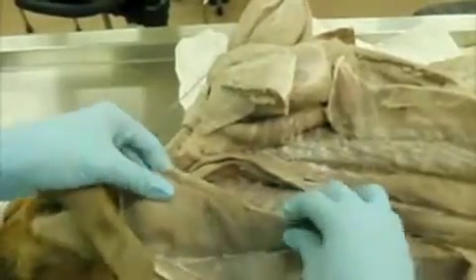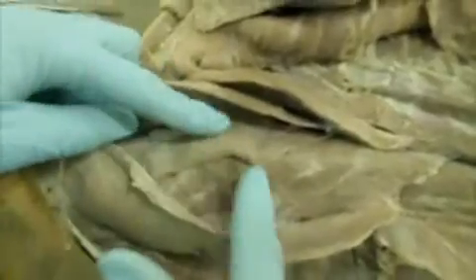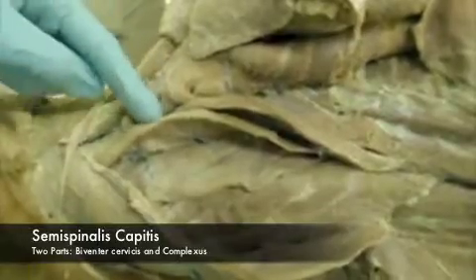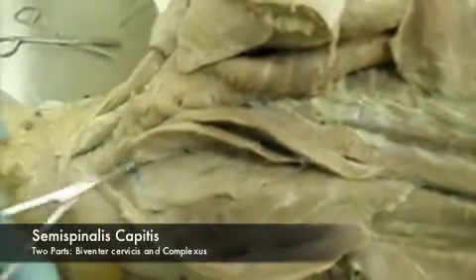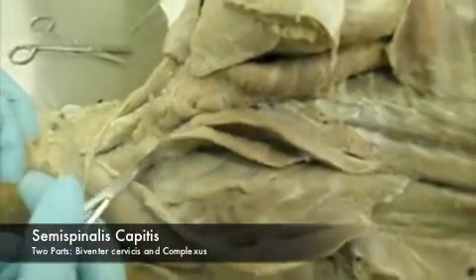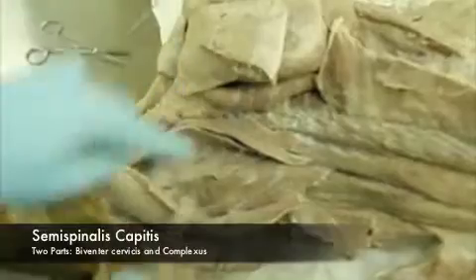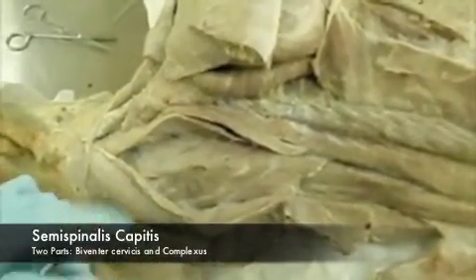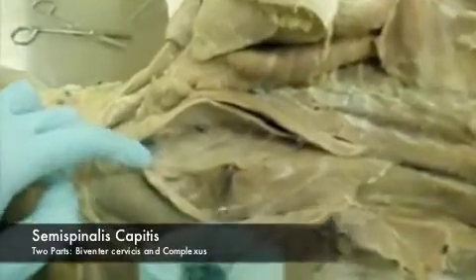So this is your splenius, move it, and underneath you have two muscles, which are known as the semispinalis capitis together. Just for reference, this muscle here is what we just looked at. It's the capitis part of the longissimus system. So I spread that and the splenius apart to see the semispinalis capitis. Semispinalis capitis has two parts, the complexus and the biventer. So here we can see this is your biventer and your complexus.